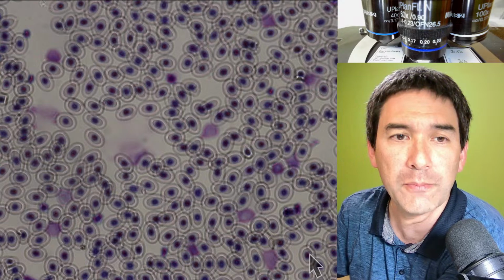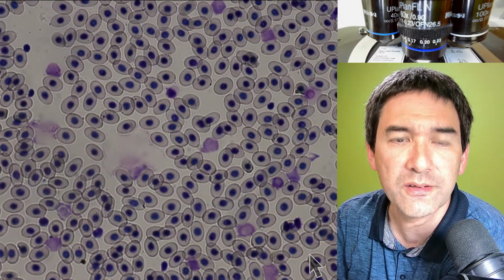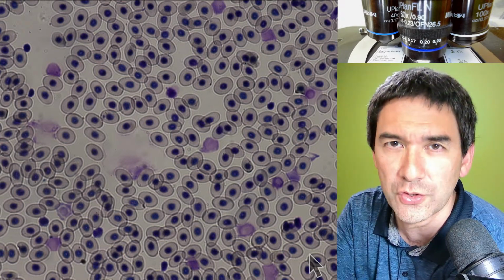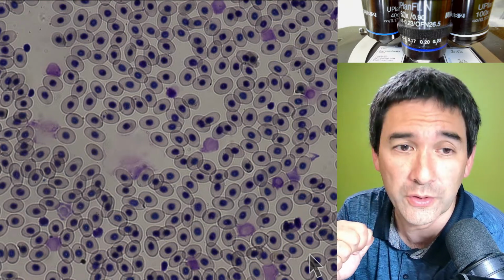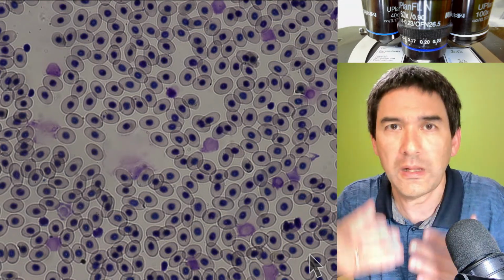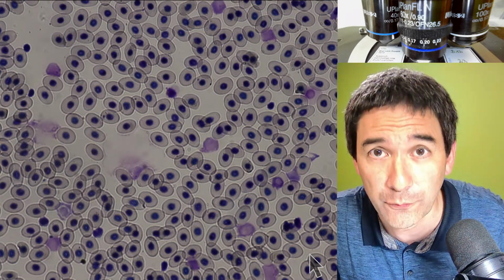A little bit of a microscope question: why can you not make zoom objectives? No, not going to work. The distance is so small, and if you make zoom objectives with a continuous zoom, you're really going to destroy the image quality. But people say, well, what's the big deal? Why can you not just add a zoom later on, just afterwards, like in the camera, for example?